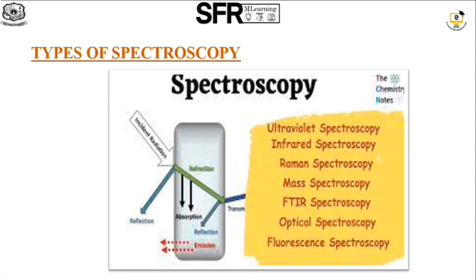There are numerous types of spectroscopy available in research, each with its own distinct principle, techniques and applications. Infrared spectroscopy is used to study molecular vibrations and rotations. Ultraviolet-visible spectroscopy is used to study electronic transitions in molecules. Mass spectroscopy is used to study the mass-to-charge ratio of ions. X-ray spectroscopy is used to study electronic transitions in atoms. Gamma ray spectroscopy is used to study nuclear decays.